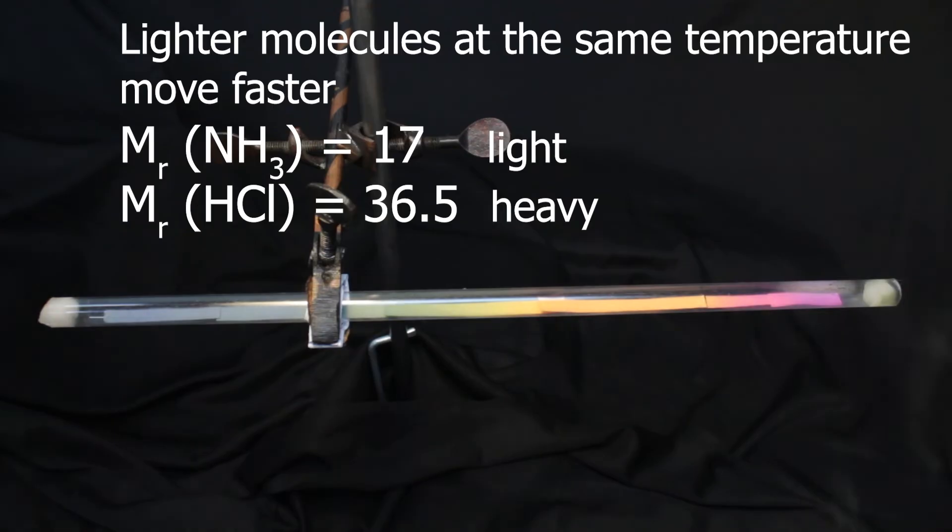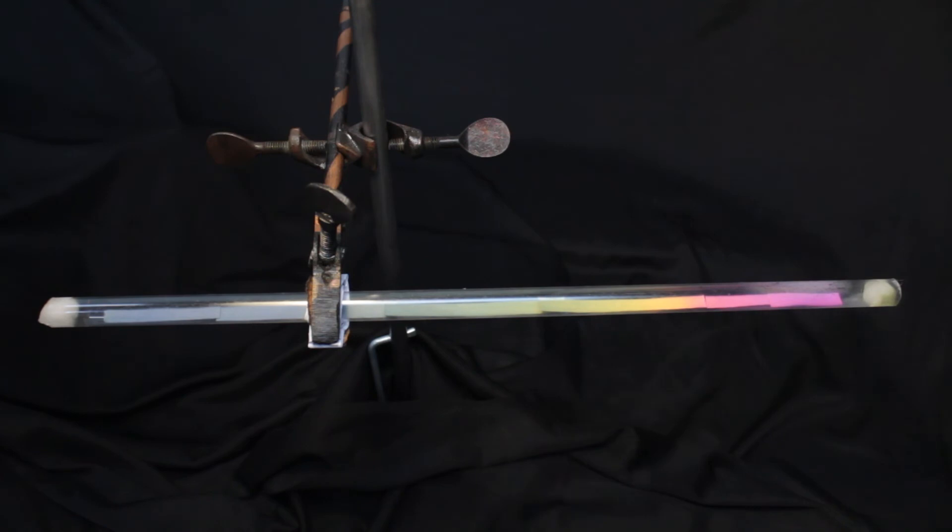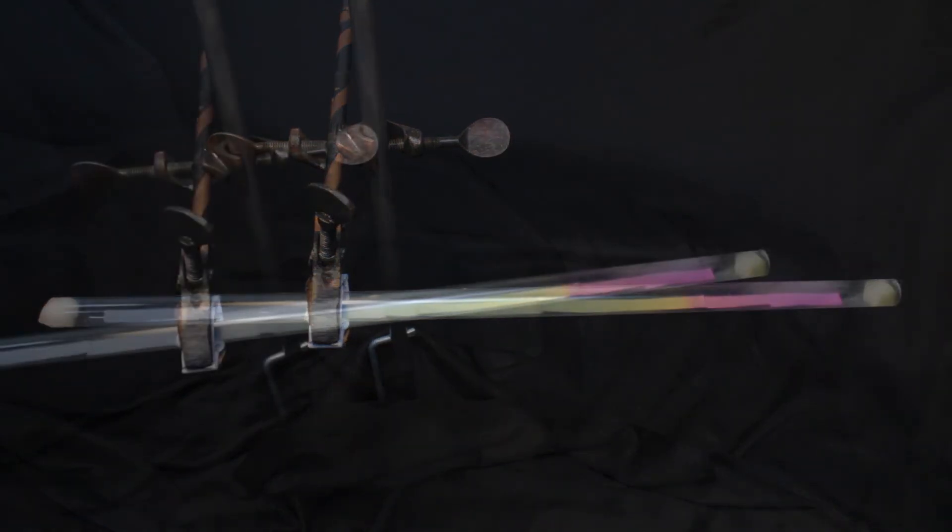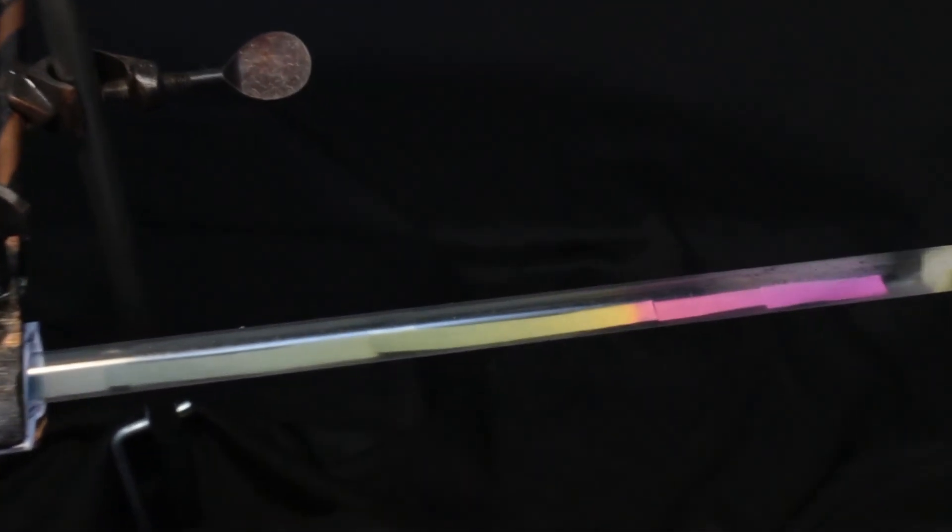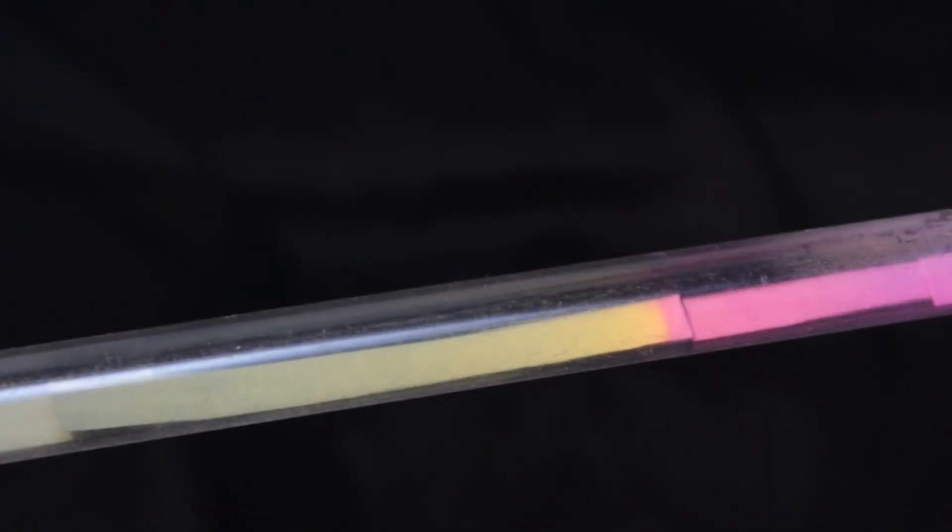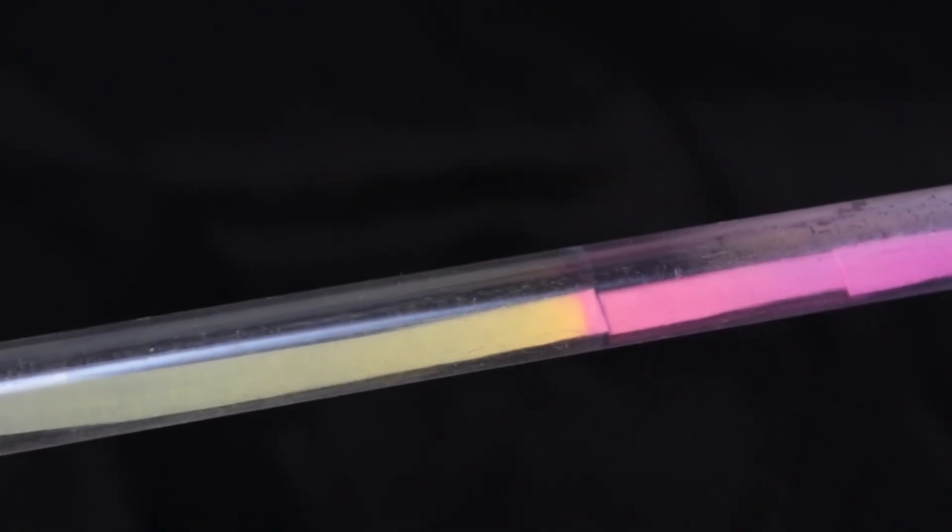The idea is lighter molecules would move faster. As you can see already, ammonia has reached well beyond the middle of the tube, and hydrogen chloride is lagging behind. Soon they are going to meet, and we will look at the place where this is going to happen.